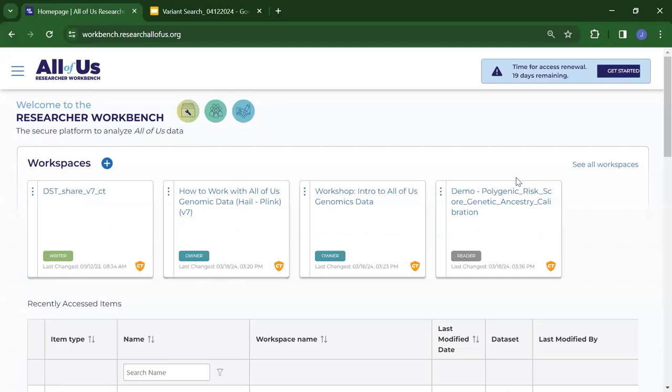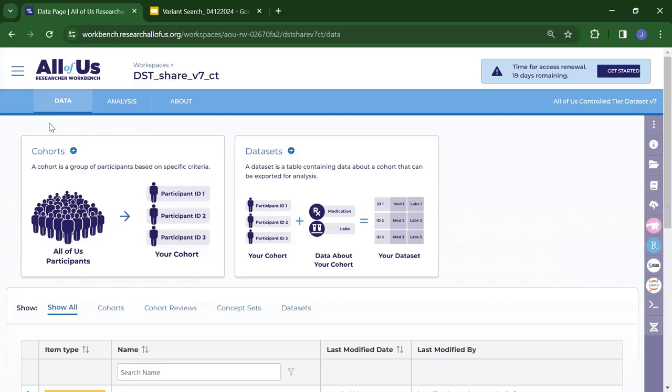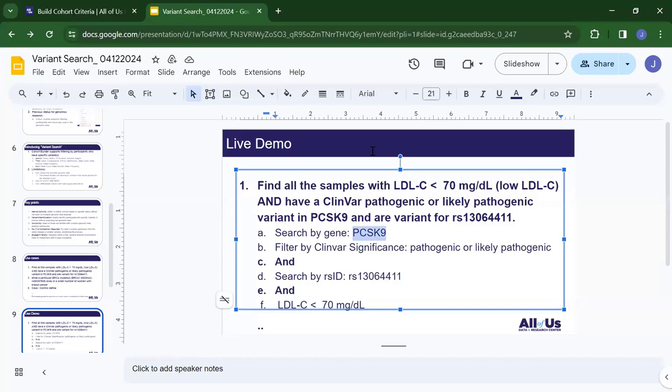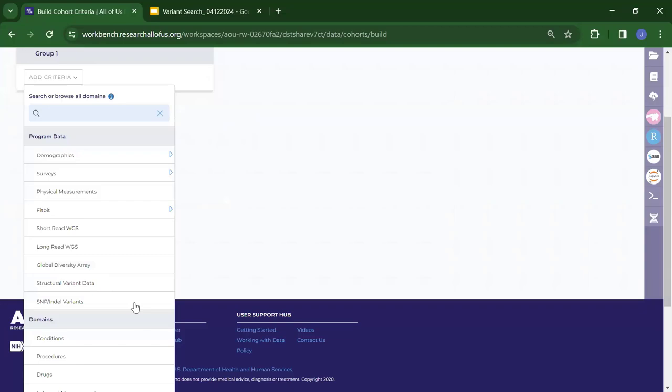Let's dive into the Researcher Workbench. This is the main page — these are the workspaces where you can conduct analysis with your coworkers. This is our team's shared workspace. This is the cohort builder and dataset builder where you select your cohort and collect your dataset. I click on cohort and add my first criteria — I'll search by gene.